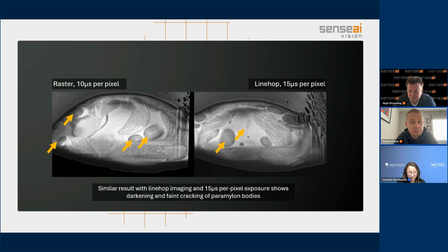Well, we do array tomography. We have serial block face imaging, both of which we have run basic tests on with SenseAI software. It does what it's necessary to. Generally, we don't suffer too much from charging on those types of samples, and they've been stable, and the projects have been running for a fairly substantial period of time, predating this project. Let's put it that way. So we've not changed the established protocol. We would consider it for new projects.